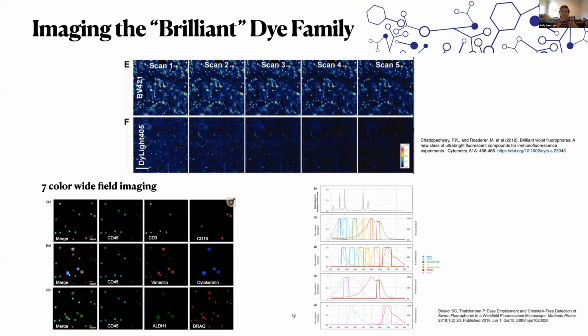And when we think of photobleaching, it's a perceptual effect. If we already started out with a dim feature, photobleaching it, even if they were both at an identical rate, you would lose the signal faster visually with a dimmer fluor. So photobleaching is very much a perceptual issue until we reach the limit that we can no longer detect.